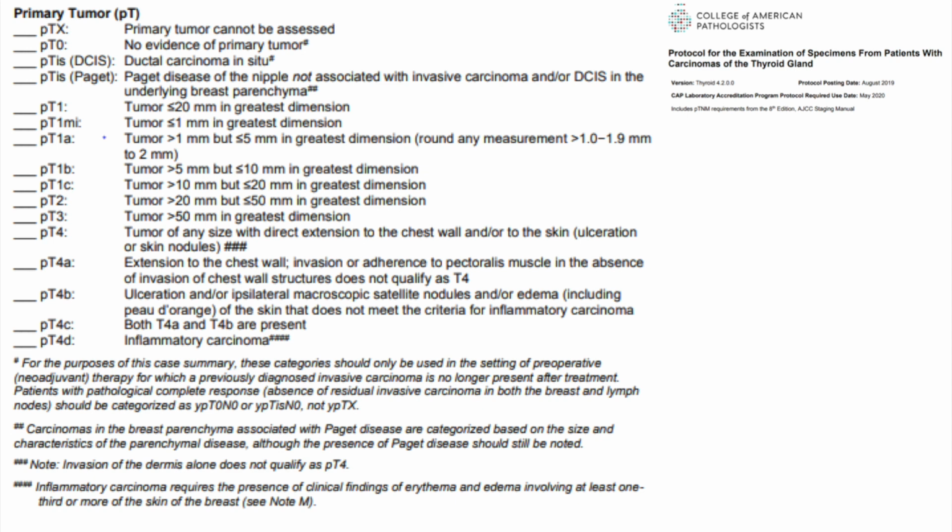This video will demonstrate sampling techniques for skin-sparing mastectomy specimens. Be sure to be familiar with the most current AJCC guidelines on the CAP website before sampling any specimen.